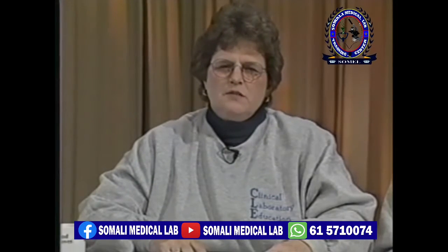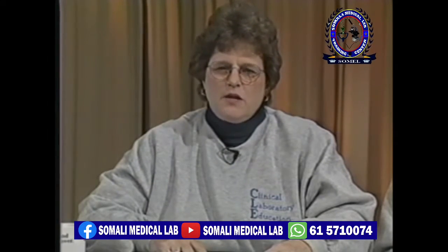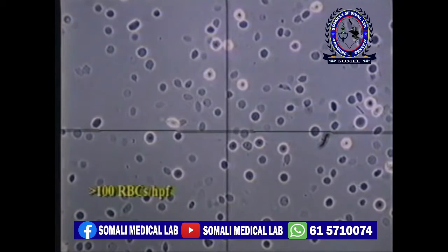When you have numerous cells, you can see the advantage of using the crosshair ocular. If this were your microscopic field, you would count the number of cells in a quarter of the field. In this example, there are more than 25 red blood cells in a quarter of the field. Once you reach 25, you can stop counting and move on to the next field. The maximum range is greater than 100. It is not necessary to count beyond this. If all your fields looked like this one, you would report greater than 100 RBCs per high-power field, after examining 10 fields, of course. That's numbers the old way.